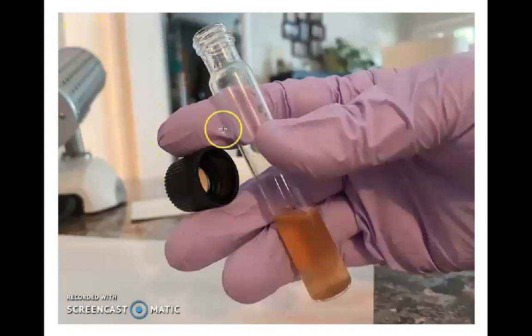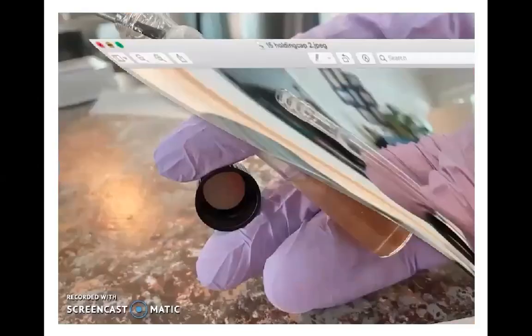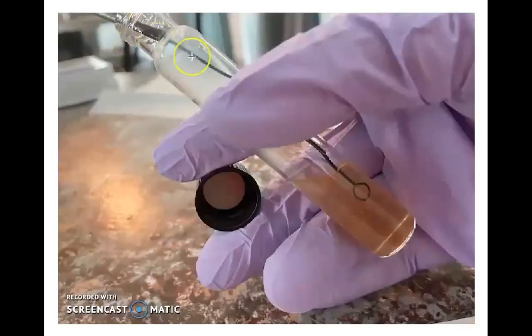When you take the cap off, you want to keep the cap in your fingers. Don't put it down on the desktop. You're going to keep the tube at an angle while you draw out your specimen. You can see I've got the loop here. I'm not just sticking the loop right under the surface of the liquid. I'm going down about halfway into the tube.